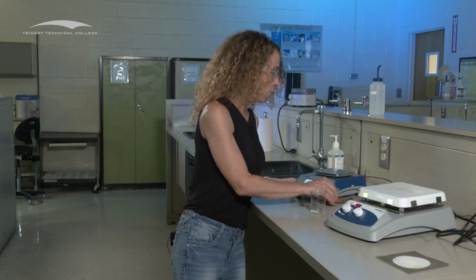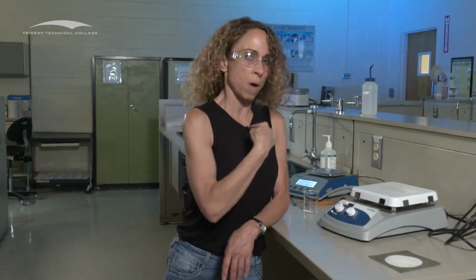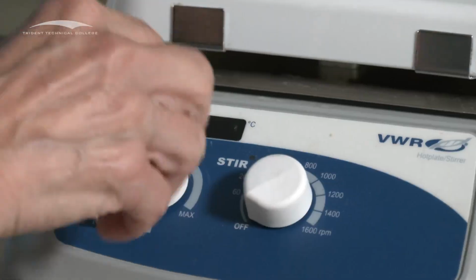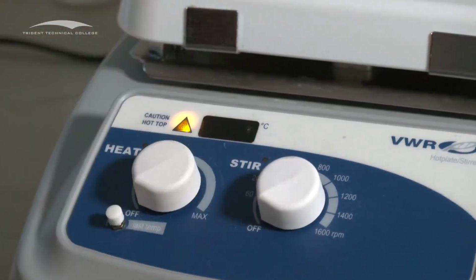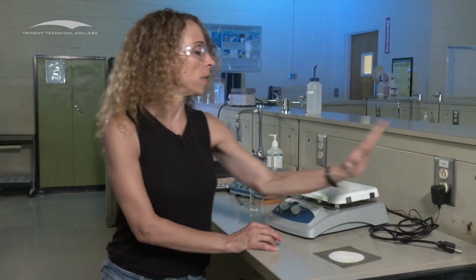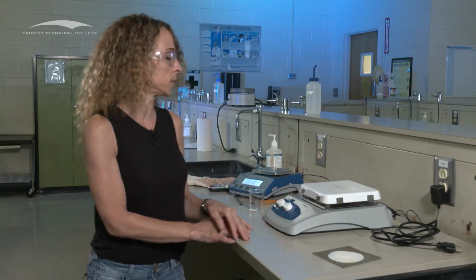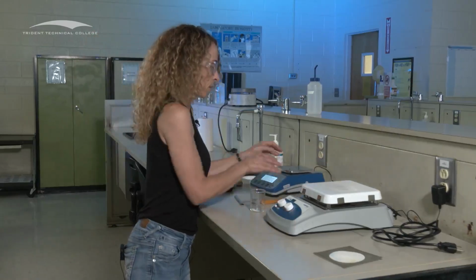Clean your balance, okay? I'm not turning it off. Other people are using it. I am, though, going to turn off my hot plate, because it's very hot. Not only am I going to turn it off, I'm also going to unplug it as well, okay? And then just remember, it's very hot. Don't touch it. No pens near it. Watch for your shirt, anything like that.